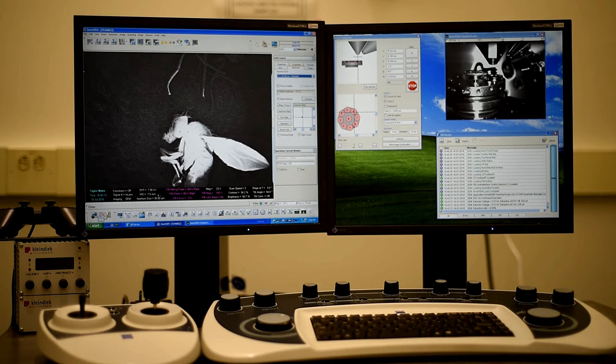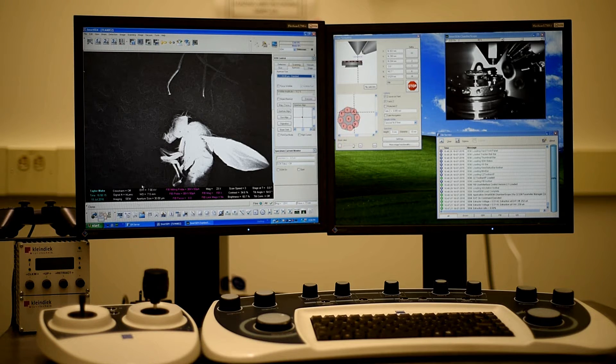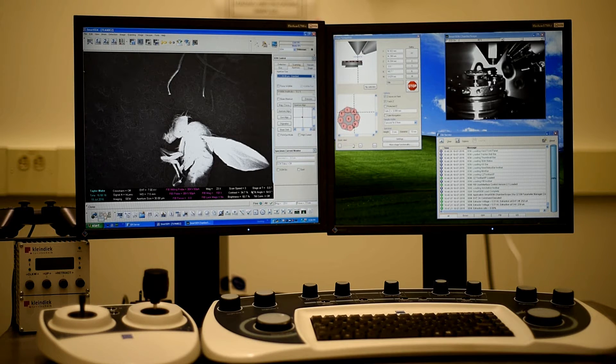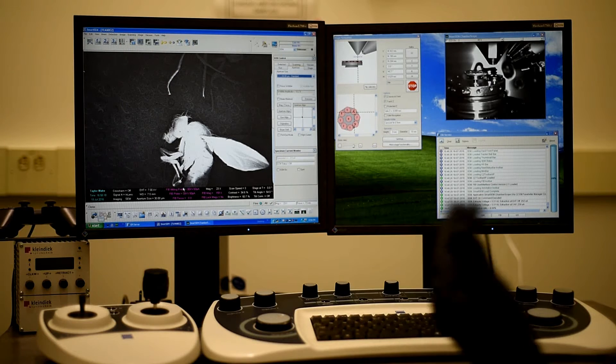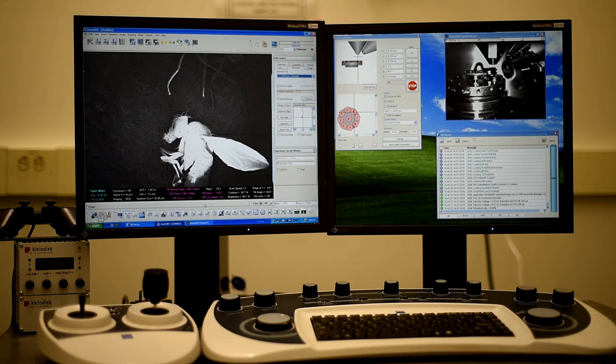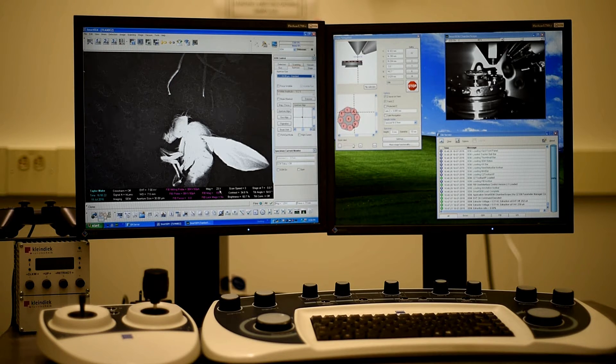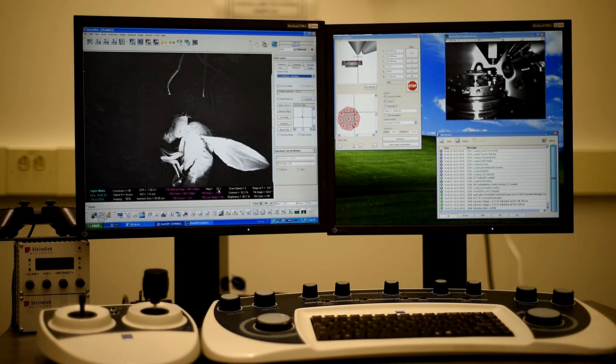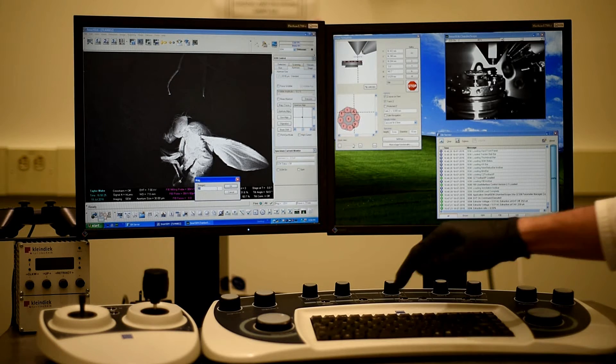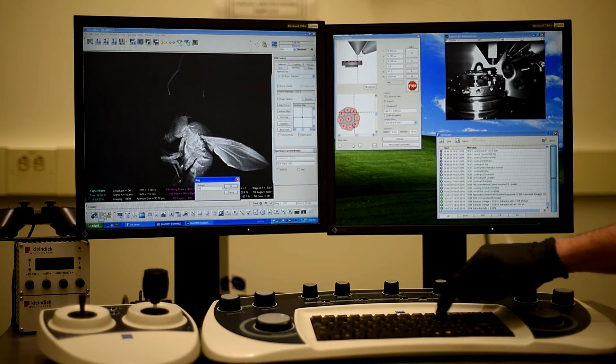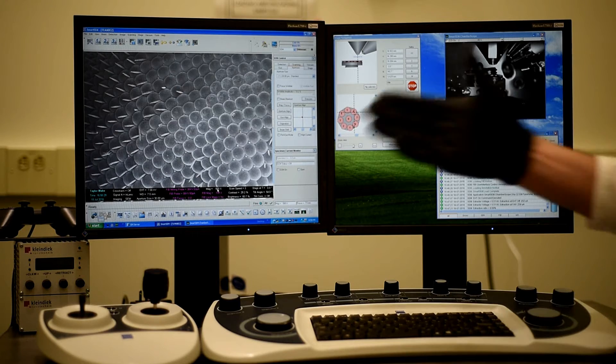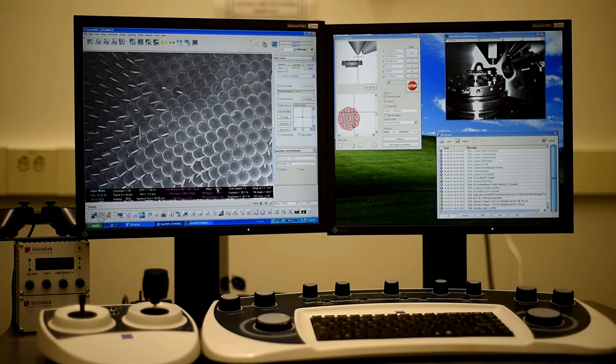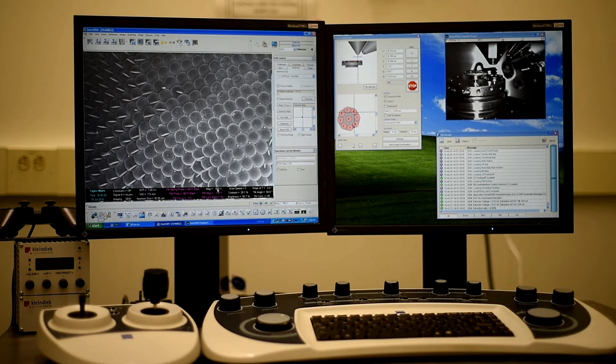So I've got mine set up for SEM, things in white, and the FIB part in purple. But say if I wanted to change the mags, the mag's at 23 right now, I can double click that and say I want it to be 500. And then hit enter, well, it's going to go to 500 times magnification.